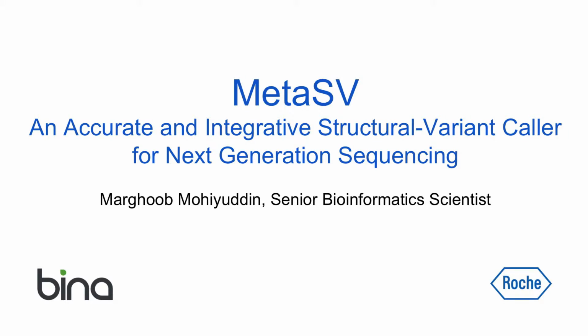I generally work on assessing and improving the accuracy of secondary analysis. More specifically, we have focused on detecting large variations called structural variations. And what we have found by looking at the current tools is that they're not very accurate when it comes to calling these large variations. So we developed MetaSV, which uses an ensemble approach to detect structural variations.